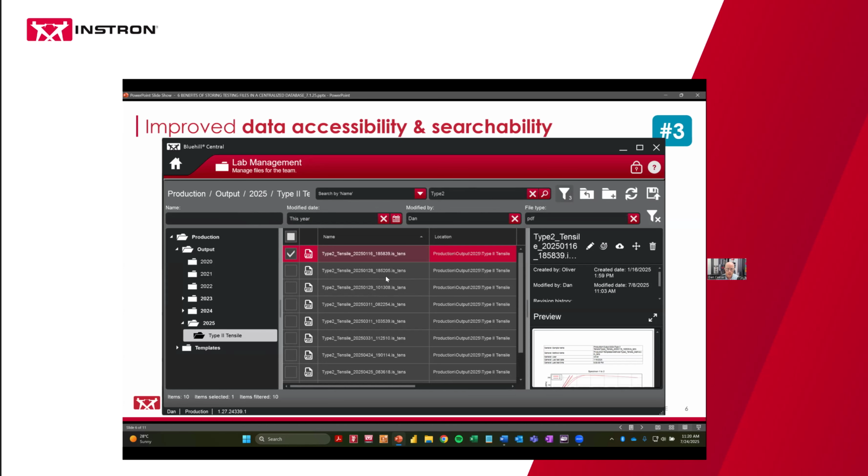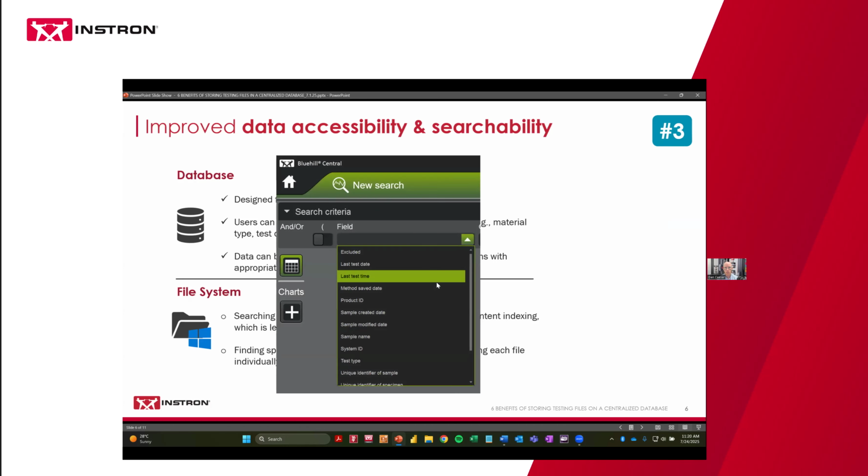to help you find what you need to access a particular file. And the second screenshot is specifically for Trend Tracker. If you are trying to identify a sample or a particular result using discrete metadata that the operator has entered while they're testing, like the material code, system ID, product ID, whatever you are using to identify the material being tested, that's what's going to be in your Trend Tracker database for you to search and build queries off of, to return all of the results associated with that particular thing you're trying to find.